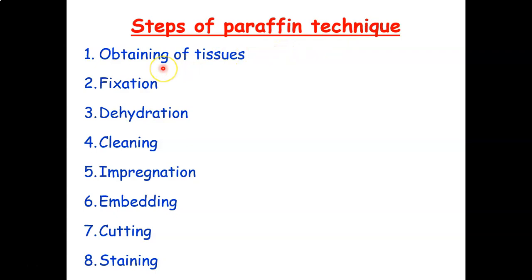Steps of paraffin technique. There are 8 steps. Each step has certain procedures and rules. Obtaining of tissues is the first step.